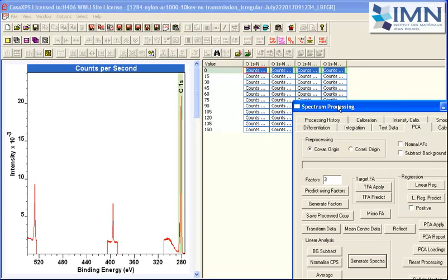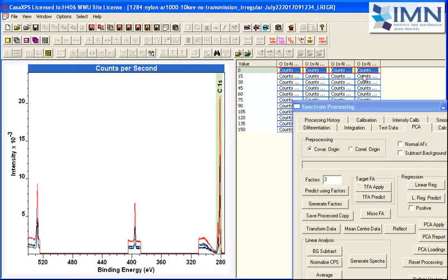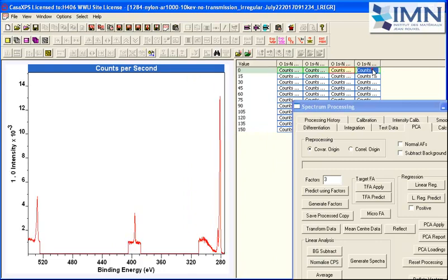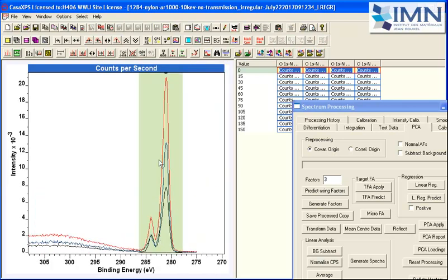This will create an approximation to each one of these spectra using the two calculated vectors or spectra. So this is one, this is the other that I calculated, and these have been scaled according to a least squares solution, so that when I combine this row as an overlay, you can see that we reproduce almost exactly, well, within numerical error, the first two spectra.